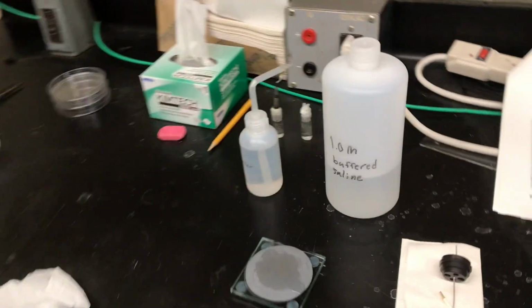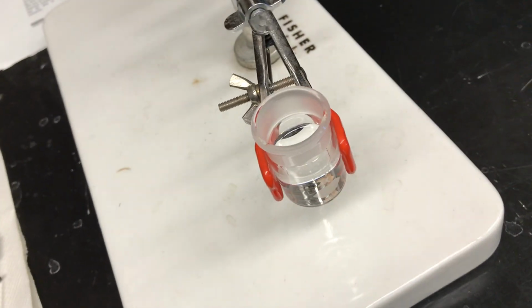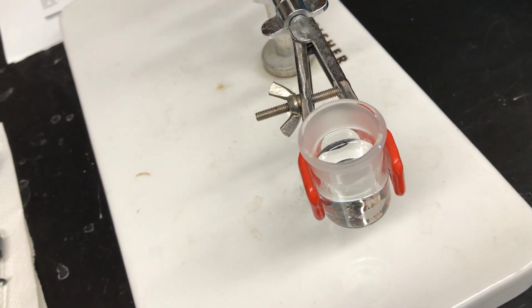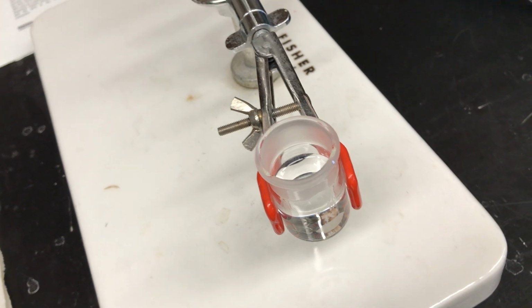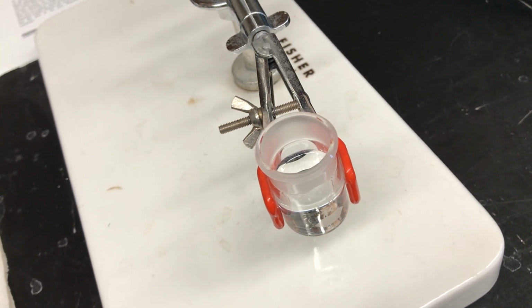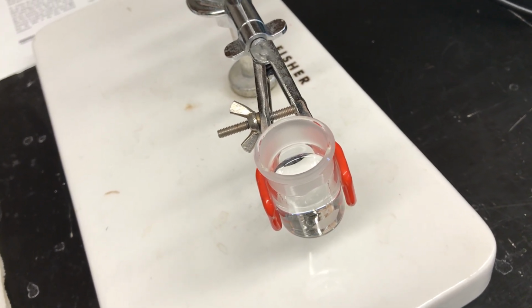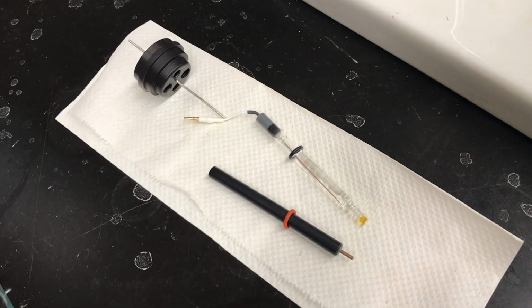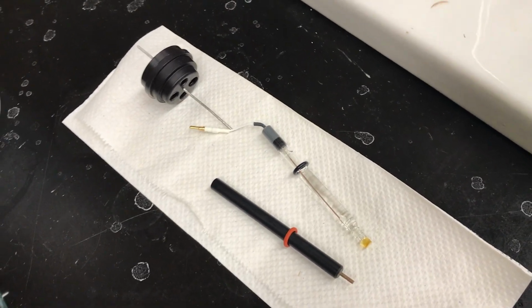Now at this point, I'm going to come back around to the electrochemical cell itself. Now the cell, of course, is going to be in a container. And the container right now holds the 1 molar buffered saline solution. So we're going to run a cyclic voltammogram on that to determine what the background voltammetry is going to look like. Now to do this, I have to set up the 3 electrodes in my 3 electrode cell.